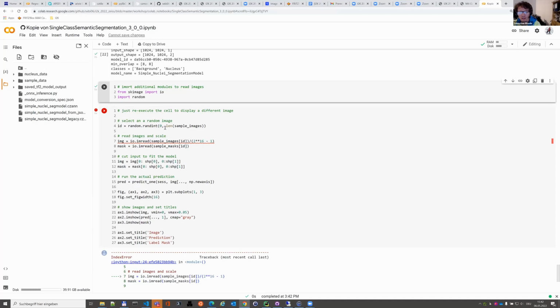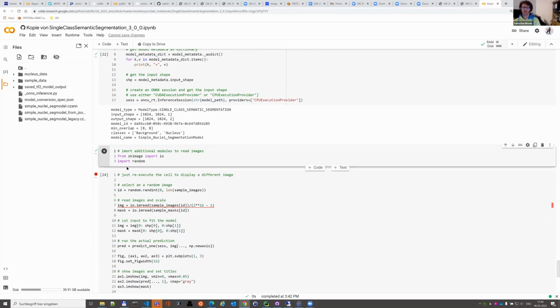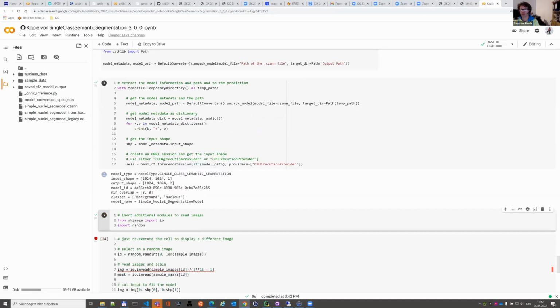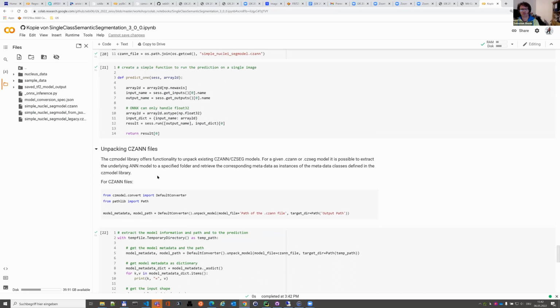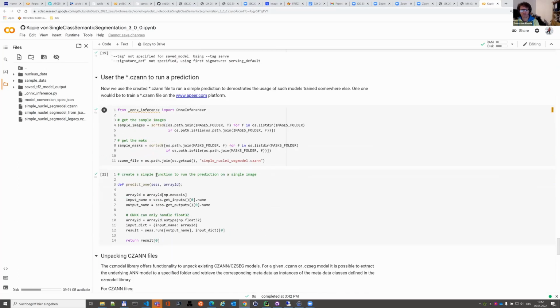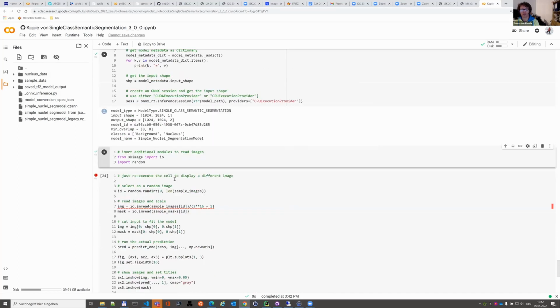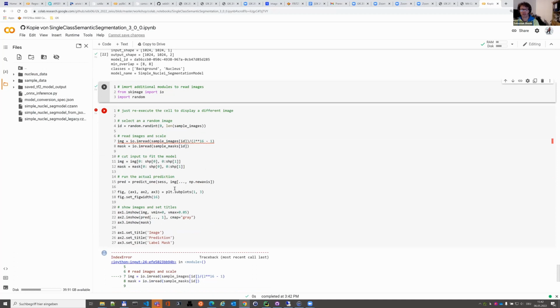Length sample images. Okay, I have to check. Sorry for that. I will fix it as soon as I find time. That's always the case in live workshops. One thing won't work. I'm wondering if I missed some cell. Let me quickly check. I don't think so. Probably a mistake on our side.